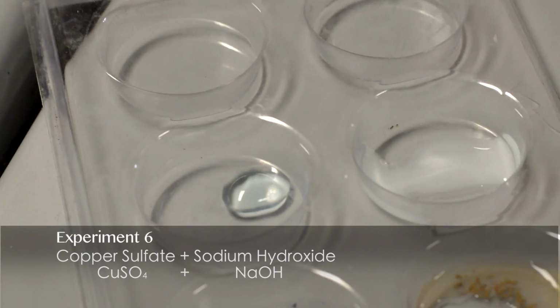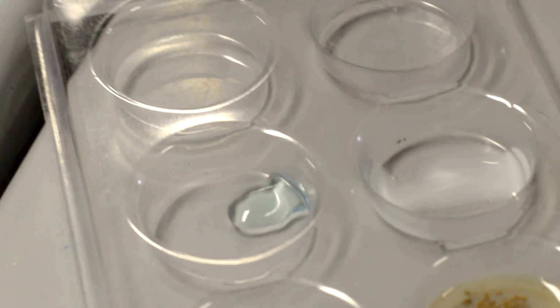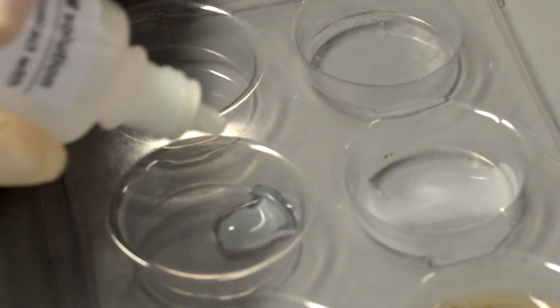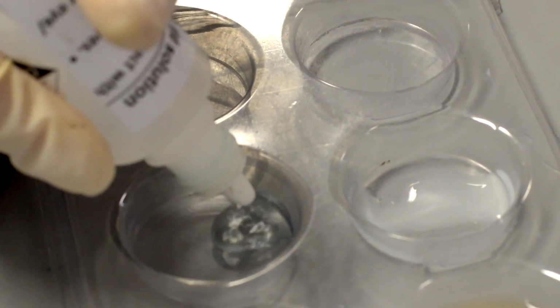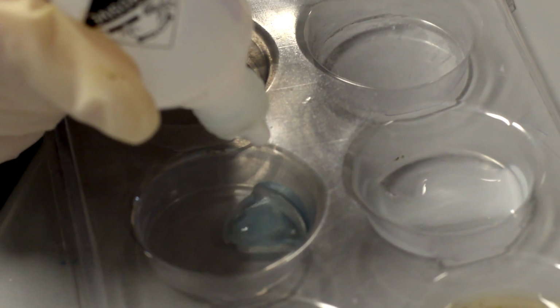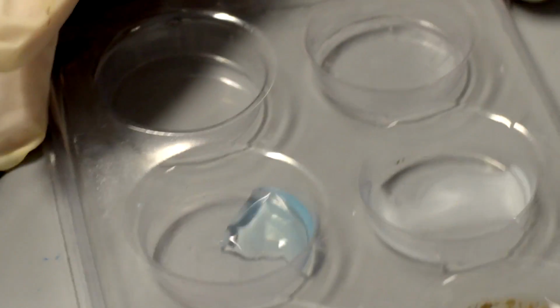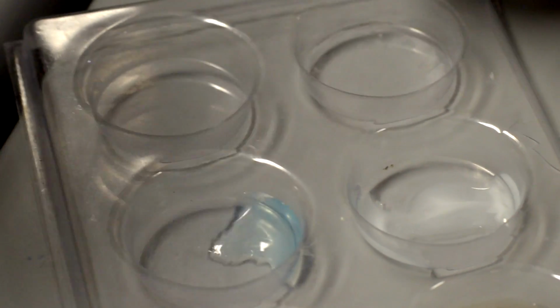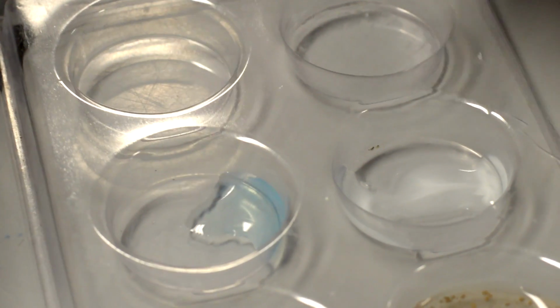It's blue. Copper sulfate. And she's going to add sodium hydroxide in a few seconds. Can you see any changes? It looks kind of oily, blue and oily.